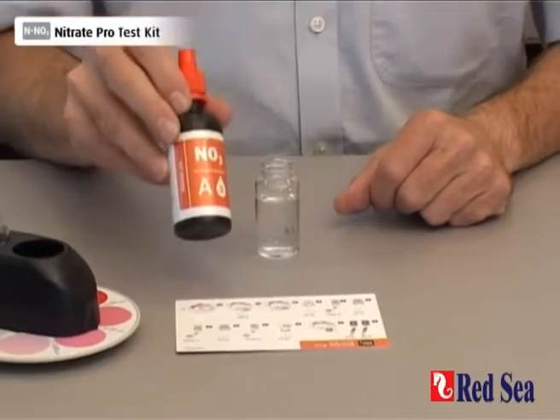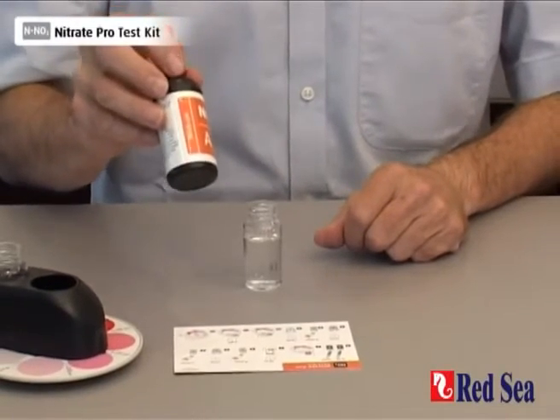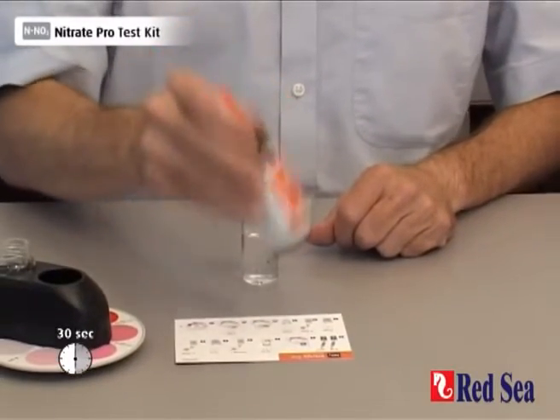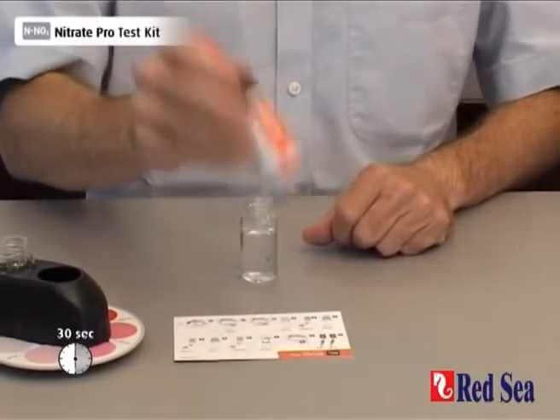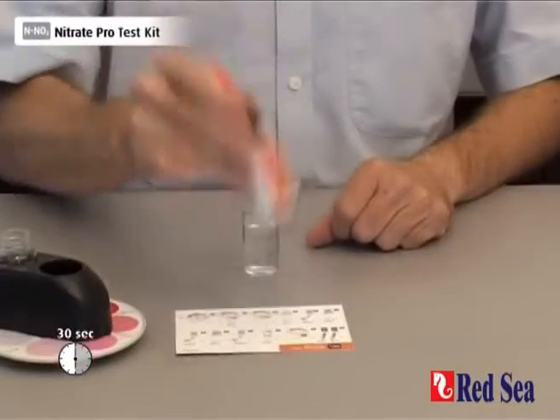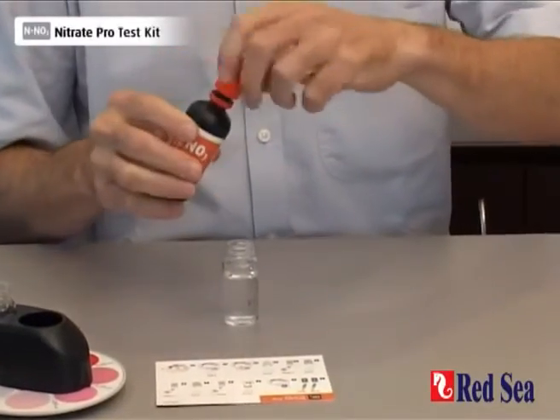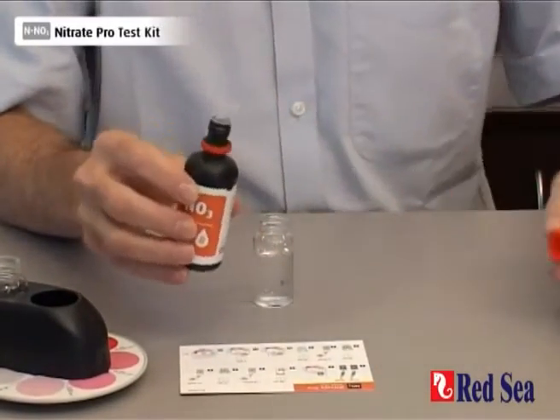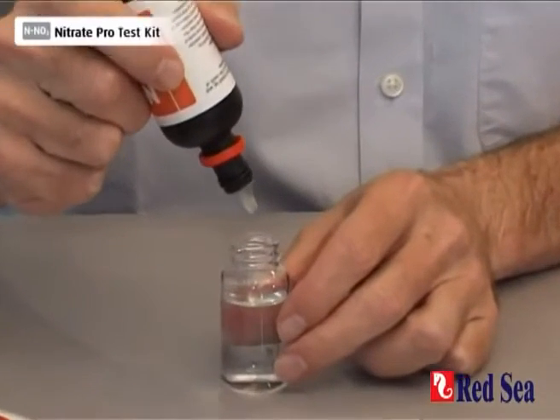We first need to take Nitrate Reagent A. What's important is to shake this very, very well for at least 30 seconds. We're going to quickly put eight drops into the vial. The purpose of the shaking and the speed is because it's a suspension, and if we don't do it quickly enough, the reagent will not work properly.